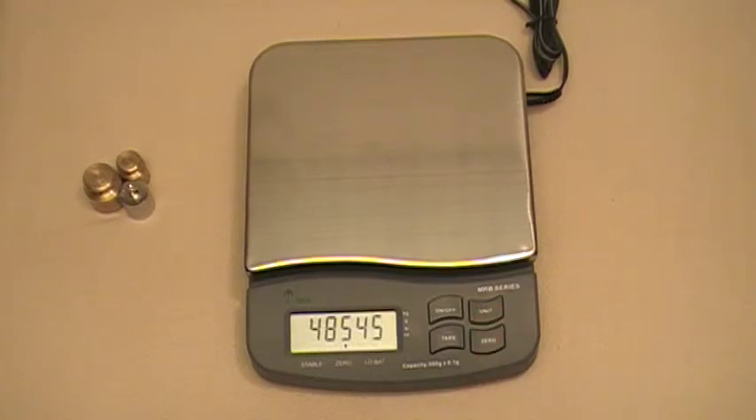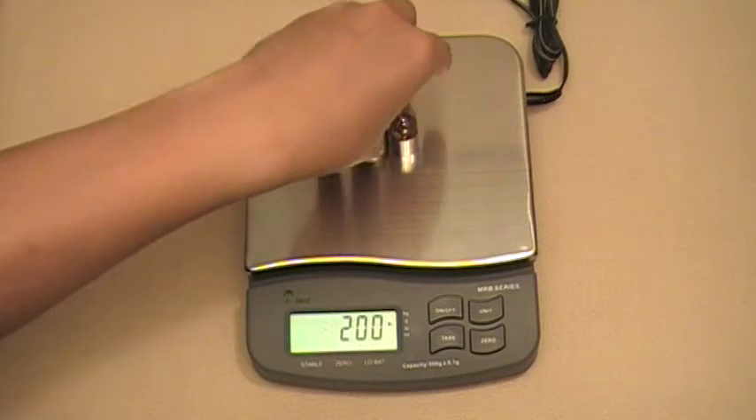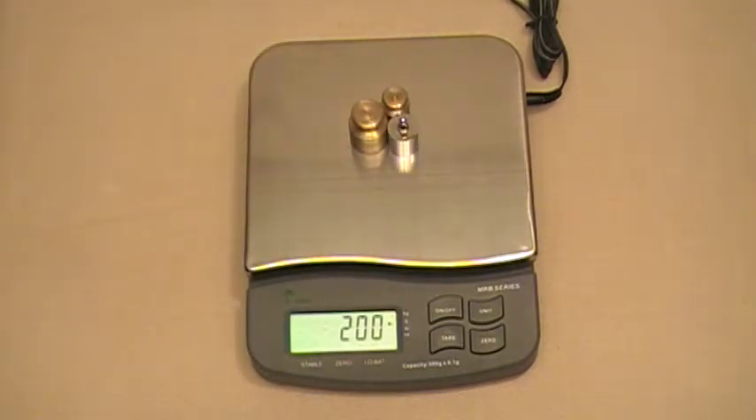Wait for the display to show zero, zero, save. Now it's ready for 200 grams on the scale. Place your test weight on there and wait for the stable arrow to come on. Once that comes on, press the unit key again.